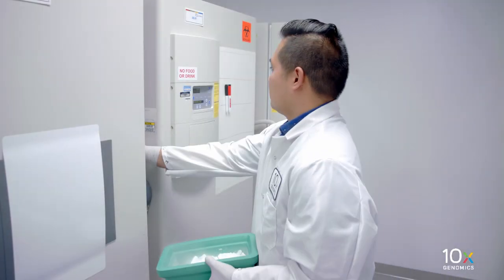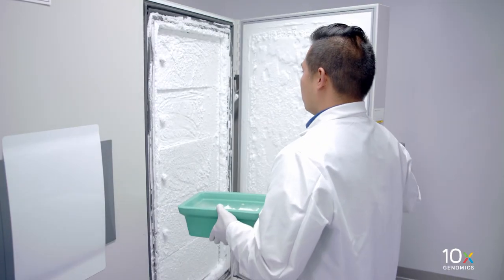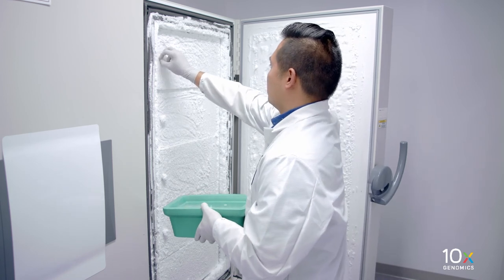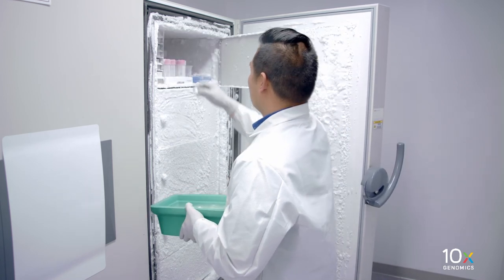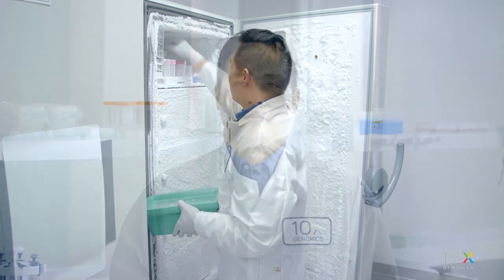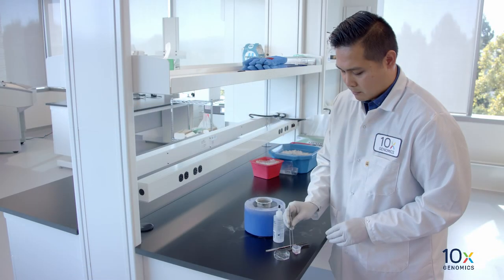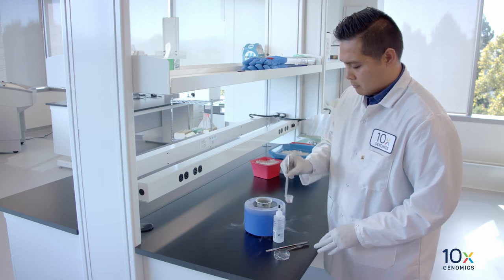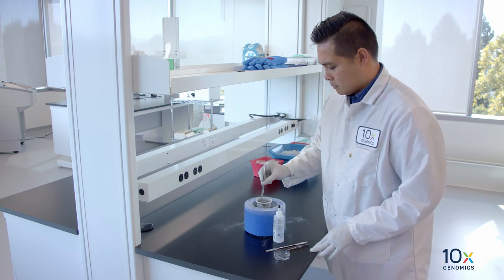Store the OCT embedded tissue block in a sealed container at minus 80 degrees Celsius for long-term storage, or immediately proceed to cryo sectioning and section placement. We have OCT embedded the frozen tissue, and next we will simultaneously freeze and OCT embed fresh tissue.